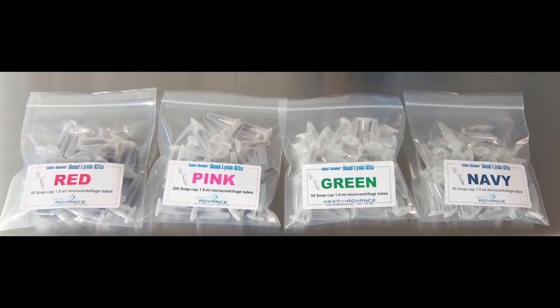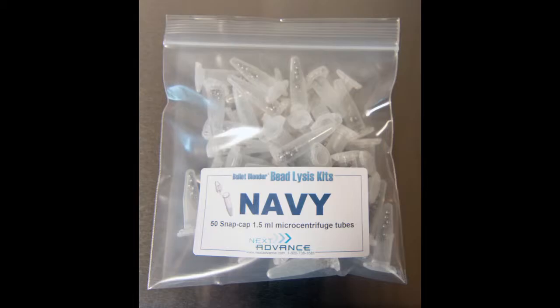Alternatively, to save time and still get great results, you can use the NEX Advanced Bead Lysis Kits to homogenize your samples. The Navy Kit 2 will work for most plant samples.